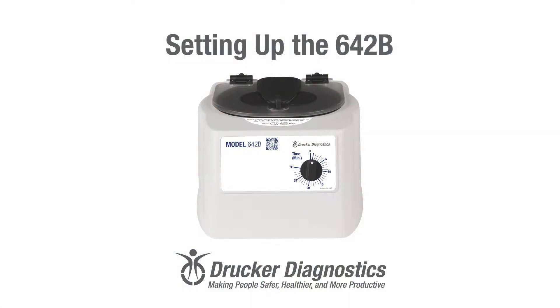Hi, I'm Dawn with Drucker Diagnostics, and today we're going to set up our new 642B centrifuge.